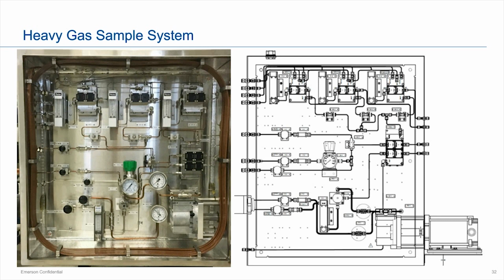You'll also notice that the tubing looks a little different. This particular sample had H2S in it that we were measuring. So Shane previously talked about the silica-coated 3/16 tubing. This is what it would look like. It's that orangey, copper-type look in there.